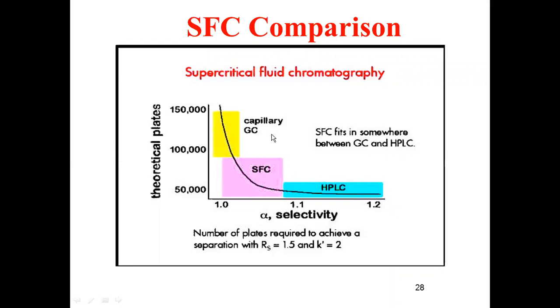As a whole, gas chromatographic separation will yield more sensitive results when compared to SFC, but SFC will have an advantage with respect to the mobile phase, with respect to regulation in the mobile phase composition. Therefore, polar or non-polar solutes can also be separated, equal to the separation selectivity in GC. So these are the advantages of SFC.